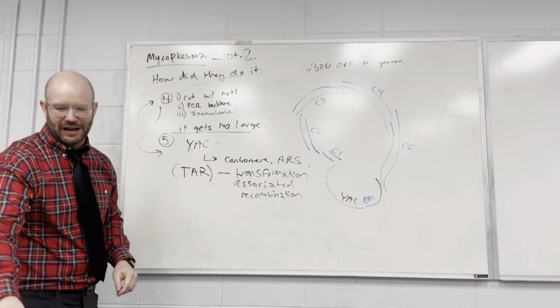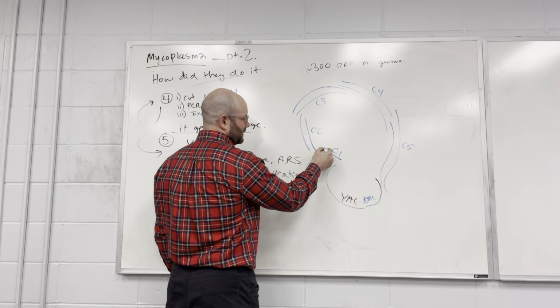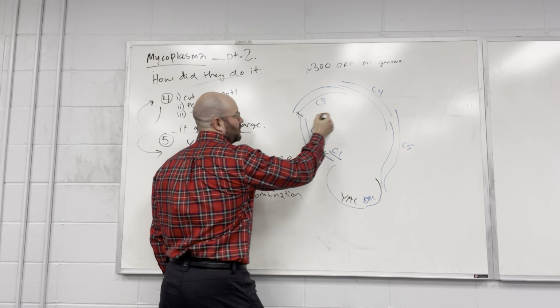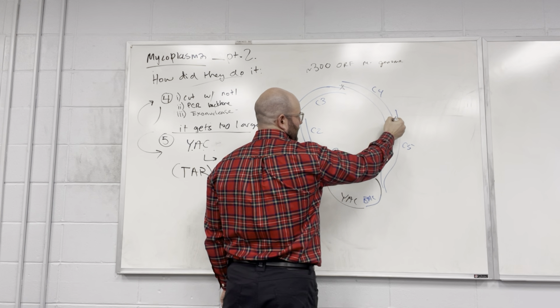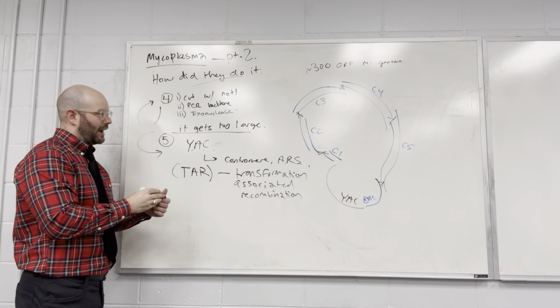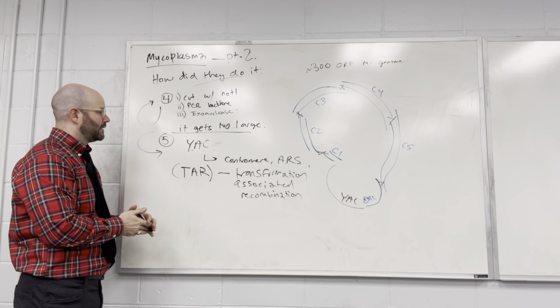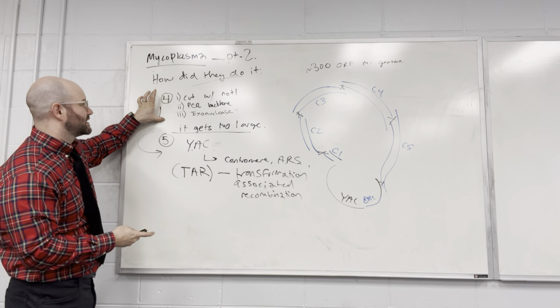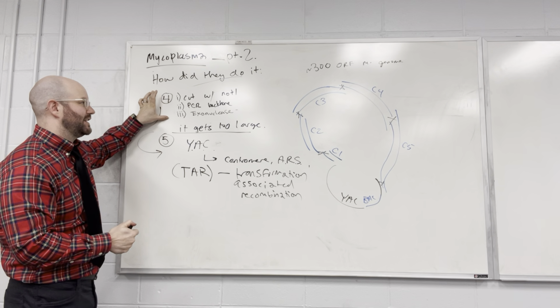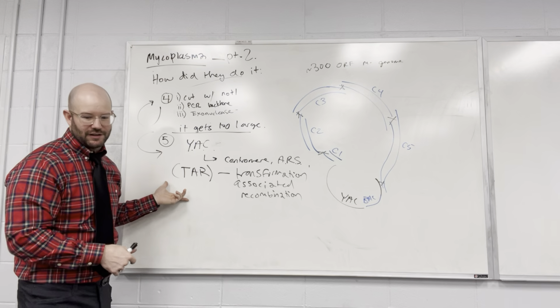Yeah, this is actually recombination, and so you don't need to add any T5 or exonuclease stuff. As long as you have the homology arms, the yeast just recombines it and creates an assembly. Before, they were adding these exonucleases to assemble. Now the yeast is just doing it.